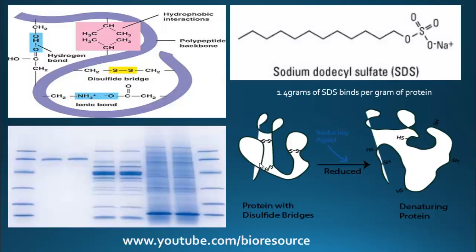So here you can see the protein has different bonds. It has hydrogen bonds, ionic bonds and disulfide bridges. So these need to be disrupted to run the protein uniformly on the gel. For that, SDS is used, as well as the disulfide bond breaking reducing agent beta-mercaptoethanol. SDS binds approximately 1.4 gram per gram of protein. That's why it gives the protein a net negative charge. And the reducing agent beta-mercaptoethanol disrupts the disulfide bonds of the protein.